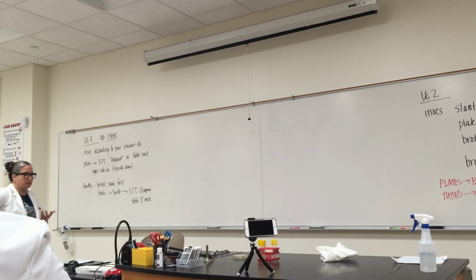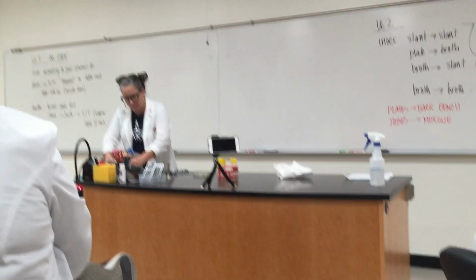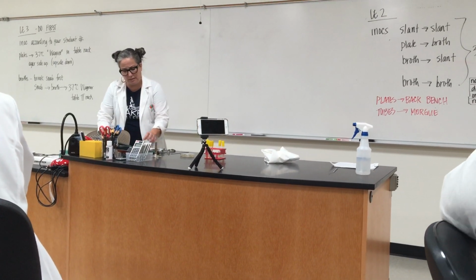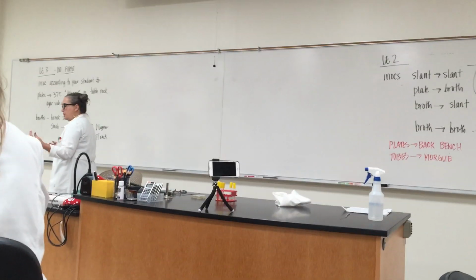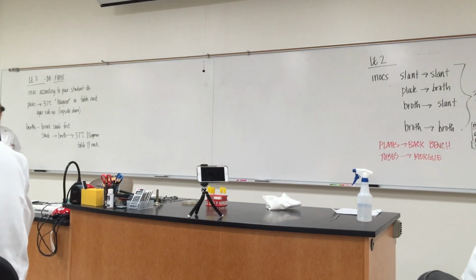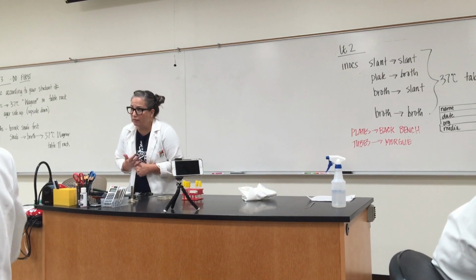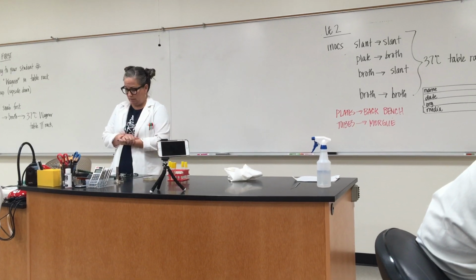So if you look at your lab manuals, in lab exercise 3, there is a table on page 36 at the very top, and there are student numbers. If you don't know your student number, look at the drawer right next to you and see that number. Look on that table for what that corresponding number says to expose your plate to. So, expose it to the air for 30 minutes. That just means you open it, leave it sitting on the counter, and 30 minutes later you close it, right?